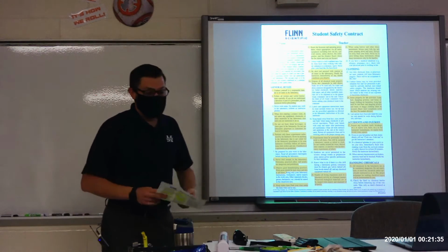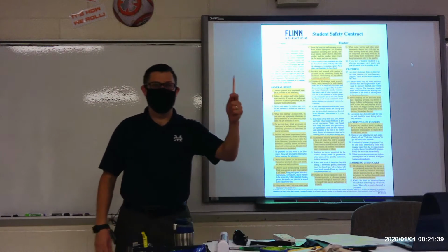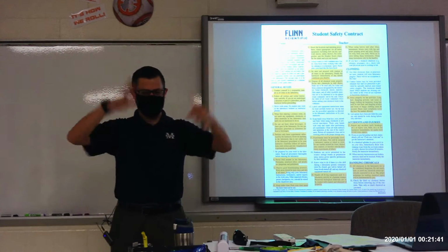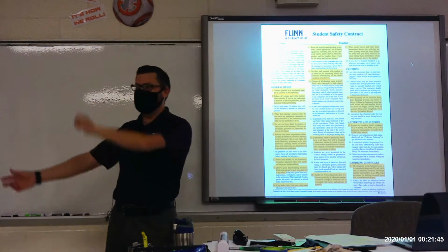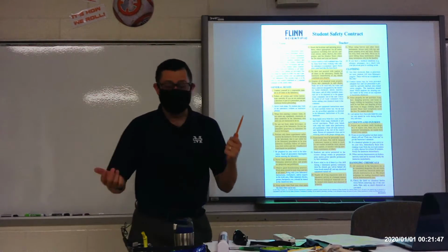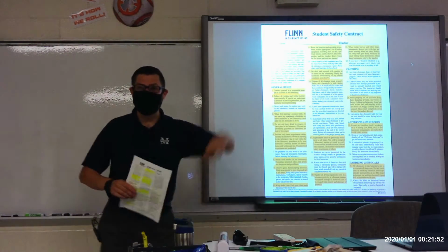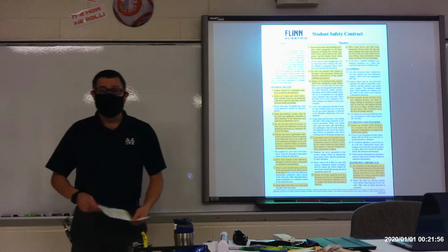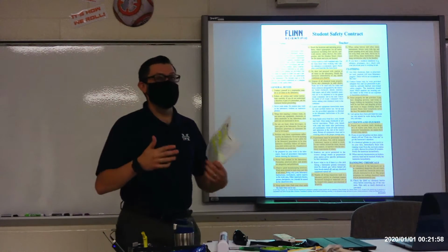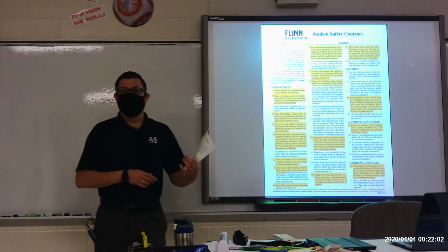If we are doing a dissection and someone has a scalpel in their hand, if you're anything like me and you tend to talk with your hands and move your hands around a lot, you don't want that scalpel to just go flying around because somebody's going to get hurt. And if somebody else around you is moving that scalpel around, you probably want to back away and then let me know. If you see somebody doing something they're not supposed to be, then let me know and I'm going to stop them.